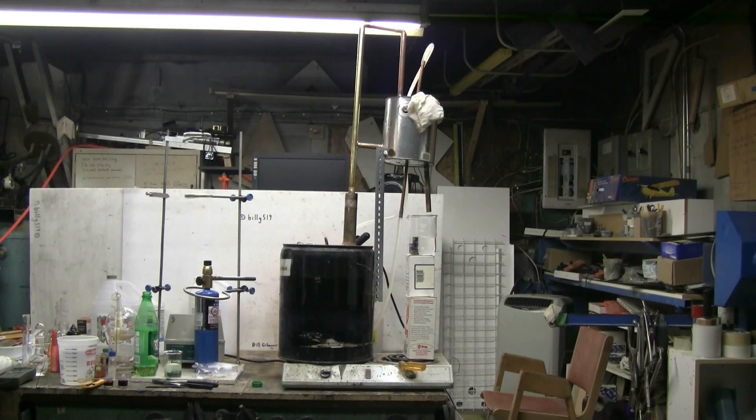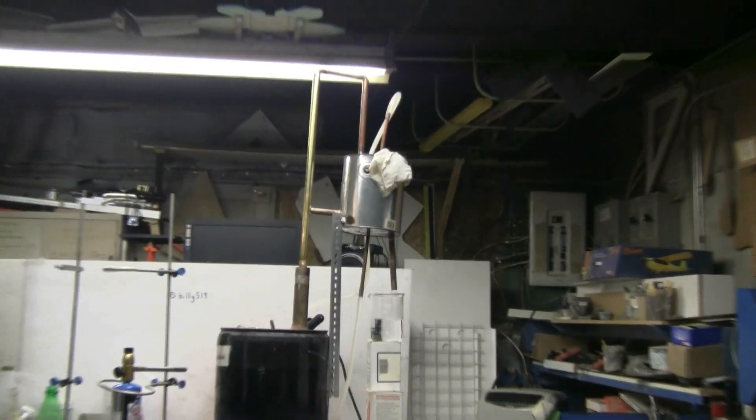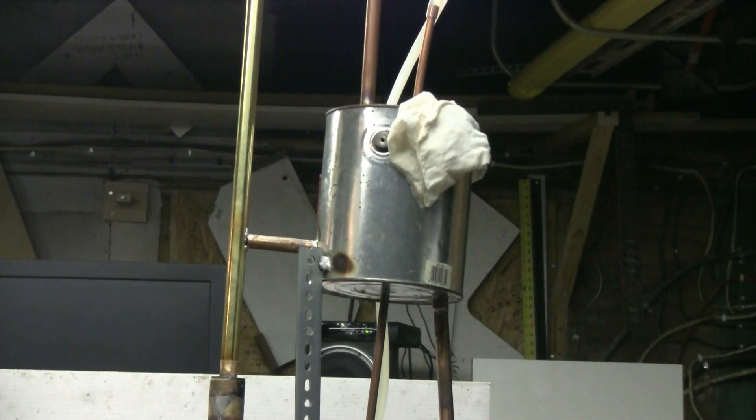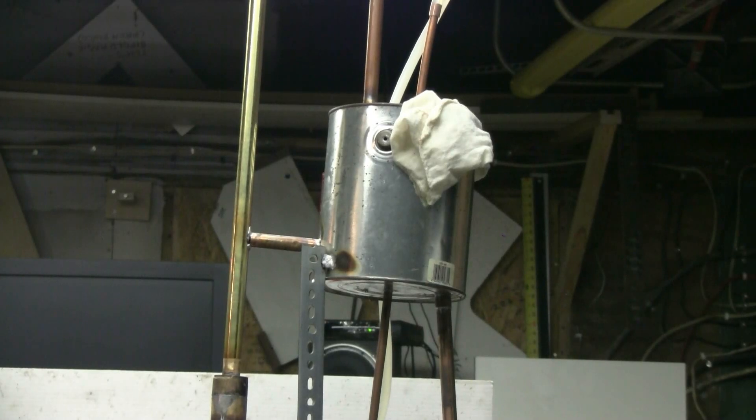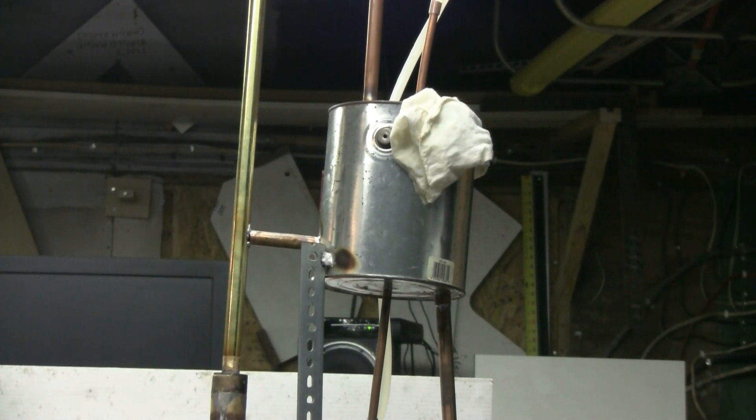Here's a quick look at my larger still for producing the ethanol that I use for my Soxhlet extractions. What I have is a 5-gallon steel pail with a non-removable top, to which I added a 30-inch tall brass reflux column, which then goes over to a 1-gallon paint can that contains the condenser coil. Water is pumped into the bottom of the paint can and leaves via a brass tube and some hose on the top.